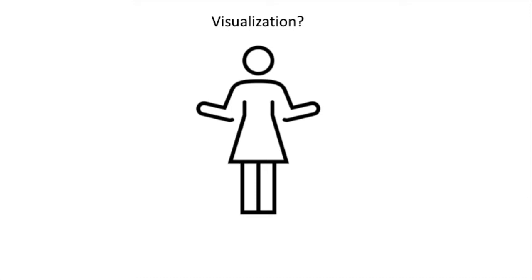Therefore, in this video, we demonstrate how GenoREC can help Ada in making critical decisions about selecting the right visualization given her genomics datasets.